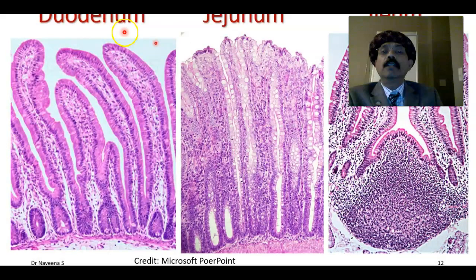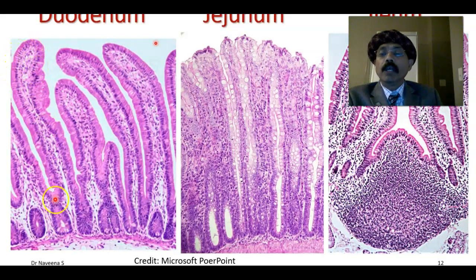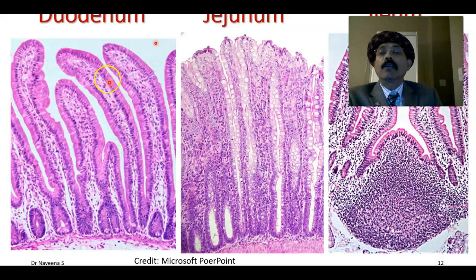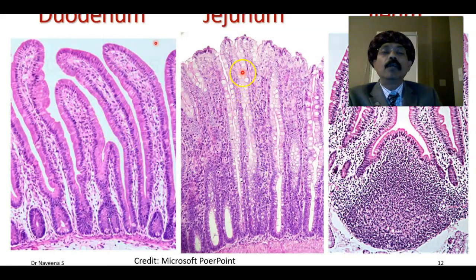Looking at the histological images of duodenum, jejunum, and ileum: this is the duodenum with the tall finger-like villi. We have the inter-villous space, the crypts of Lieberkühn, and these are lined by columnar epithelium, like other parts of the GI tract. This is the lamina propria. Here we have the villi of the jejunum — this is wider and shorter than that of the duodenum.